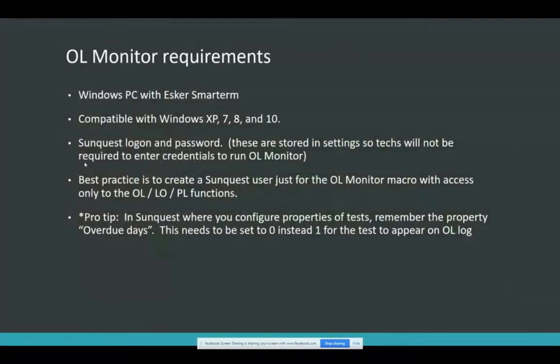Here are your requirements. You just need a Windows PC with Esker smart term. The program is compatible with Windows XP, 7, 8, and even Windows 10. It does require a SunQuest logon and password. What most administrators do is create a restricted logon that only has access to the overdue and pending logs, and that's what they use to store the credentials. The techs aren't required to enter their credentials every time just to run OL Monitor — this gets stored in there, encrypted of course.